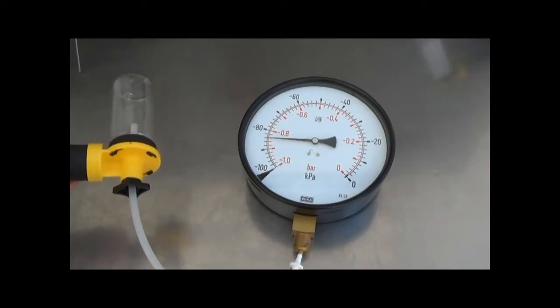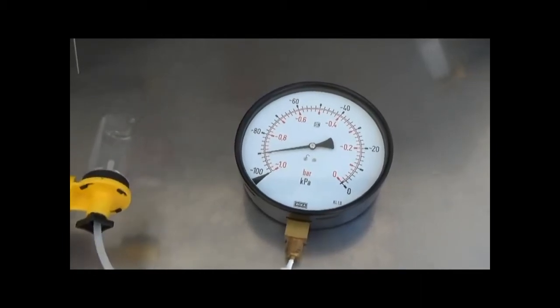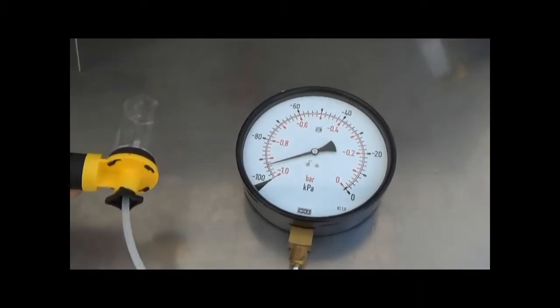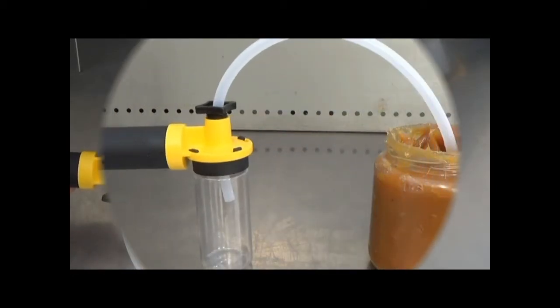If you pump up a maximum vacuum you will get close to 95% which is good enough for cold and heavy oil and even for grease.